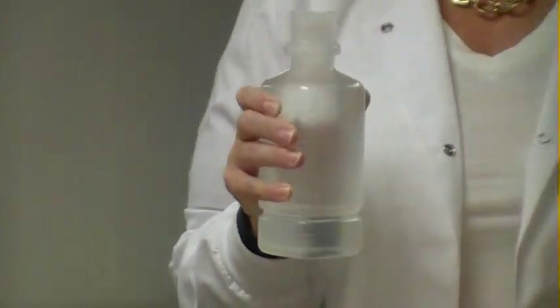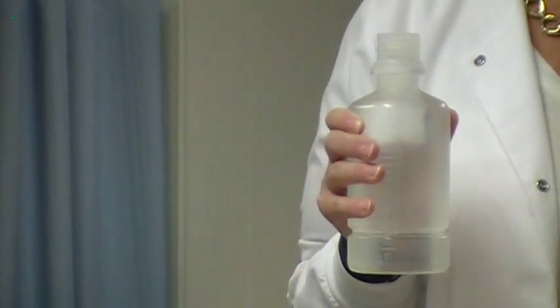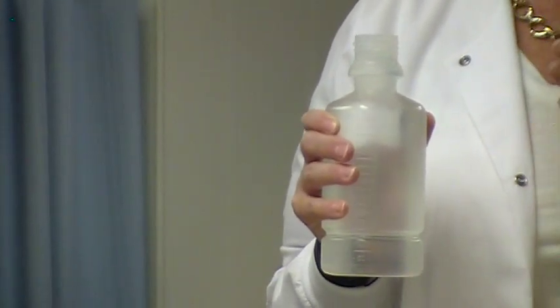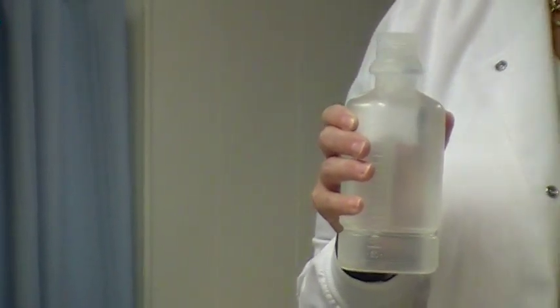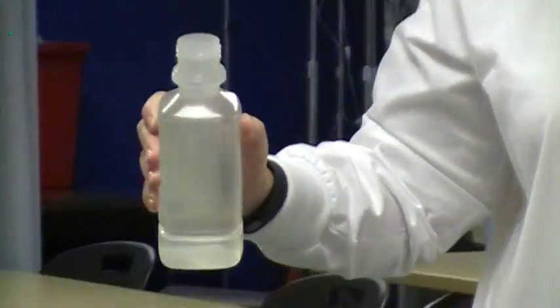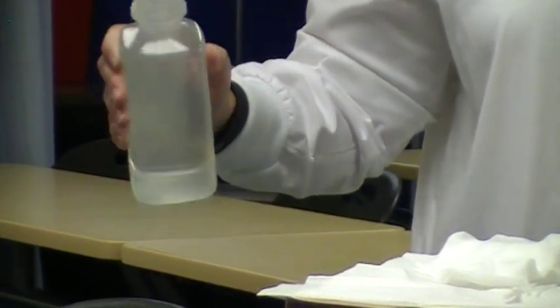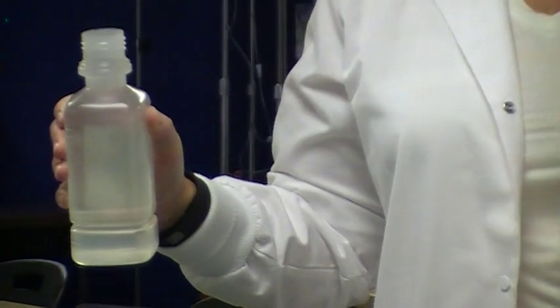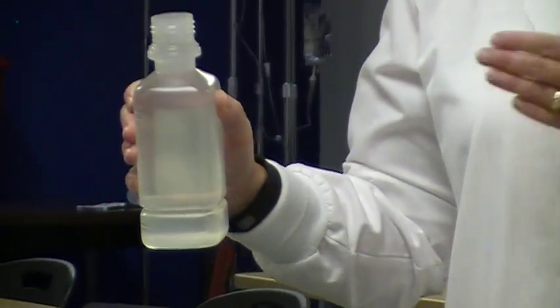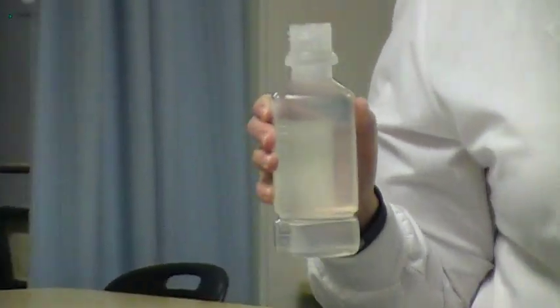The next thing that we're going to do is we're going to clear the lip of the bottle. This is called lipping. The purpose of lipping is just to clear that area. So again, I have my garbage can here. We're just going to pour just enough to lip that bottle. Okay, so that is the area that I lipped, which means that when I go back to pour, that is the area I need to pour from. So again, I want it into all 3.